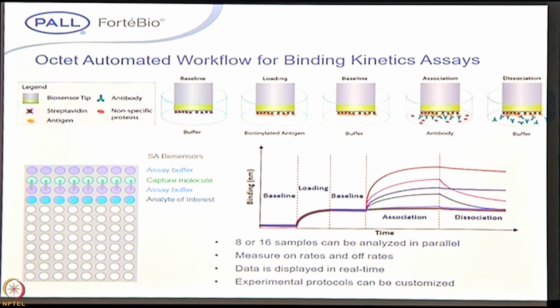As I mentioned, some molecules bind to the sensor surface, you can see the change, right? The phase shift. So you can see the loading response. When the same sensor moves back to the well containing a buffer, here just a baseline, there are no molecules binding, unbound molecules get washed off. The sensor next moves to the well containing the analyte, and you can see the response. And the same sensor goes back to the well containing a buffer, and bound analyte gets washed off. Very simple to operate this experiment.